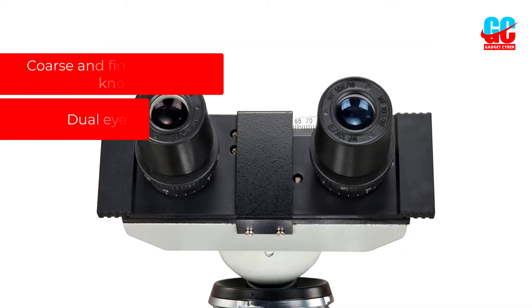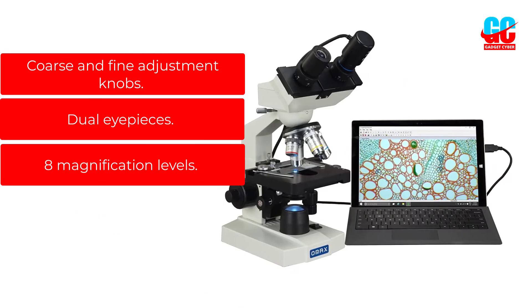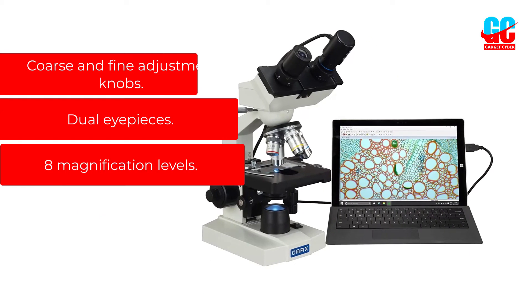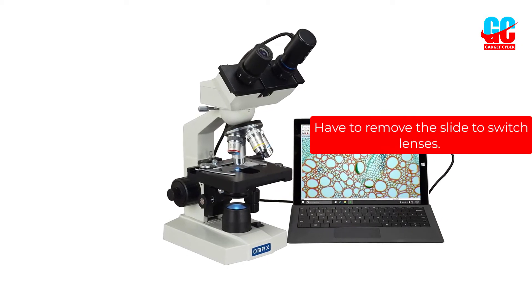Pros: Coarse and fine adjustment knobs. Dual eyepieces. 8 magnification levels. Cons: Have to remove the slide to switch lenses.